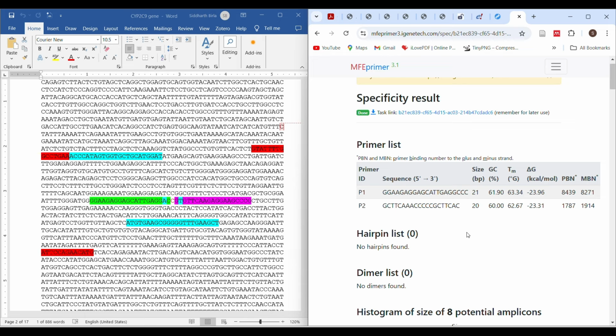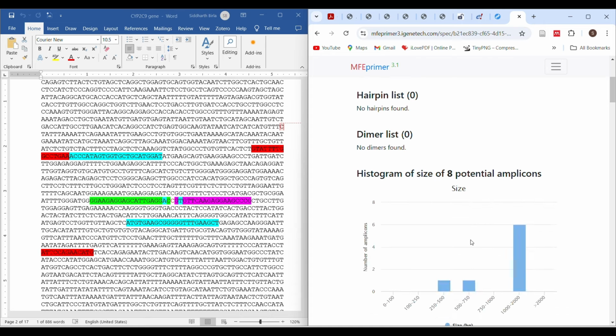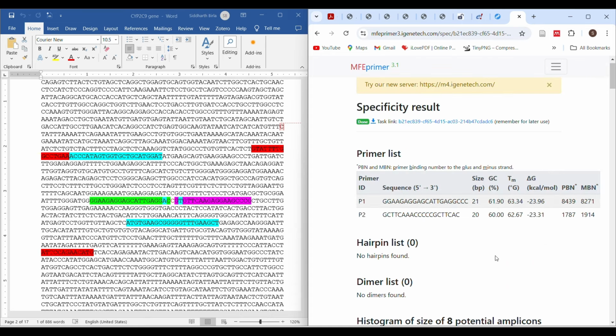So this one is perfectly alright for me to proceed, and you can check the GC also after checking the TM. GC is showing 61 and here it is 60. I told you it should be from 45 to 60 or 65, it is fine. So this is fine. Now in this case it is fine, but if I need to reduce the GC, okay, so before that I'll just note down the data, or maybe when I remove the mismatch, then I'll add it, right?